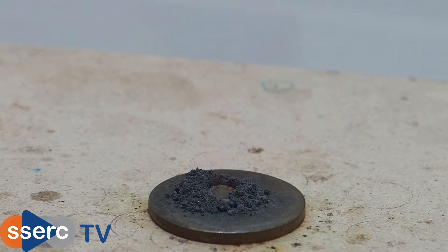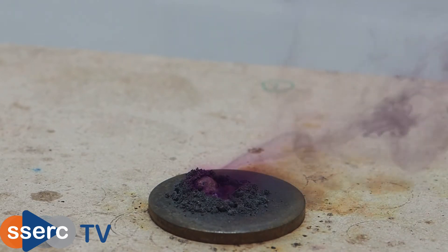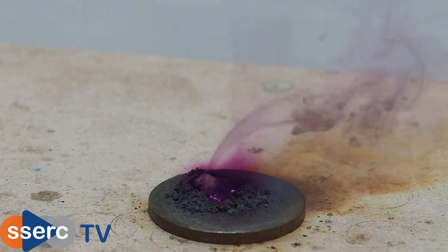Within a few seconds you can see traces of purple iodine vapour coming off. This increases. Soon you should also see some paler fumes of aluminium iodide as well, before the reaction dies down.